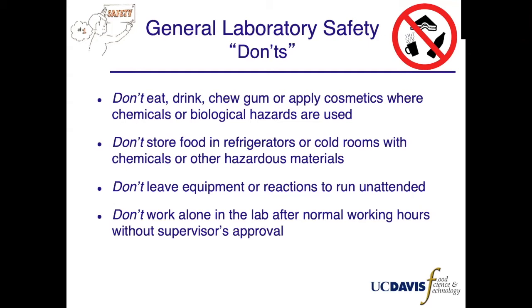Don't work alone in the lab after normal working hours without supervisor's approval. There may come a time when you may need to do some work alone in the lab. However, you must discuss this with your PI. There may be some procedures where working alone poses a hazard and is therefore not allowed. If working alone is approved, make sure you are familiar with emergency procedures and emergency contacts. A notification system within each lab for when a person who is working alone arrives and leaves the building is advised. Each lab is responsible for having a working alone SOP.